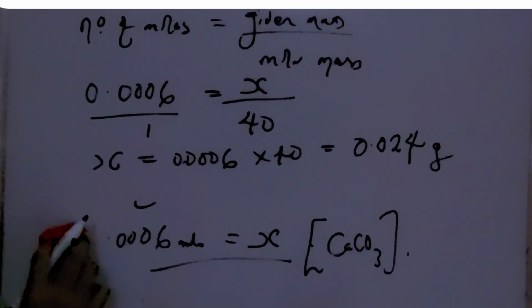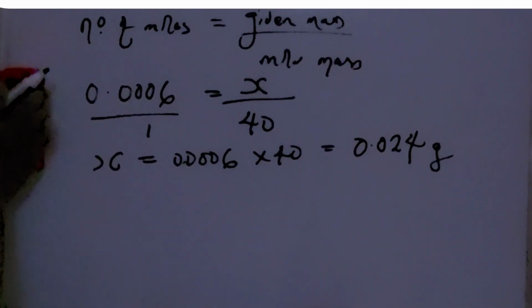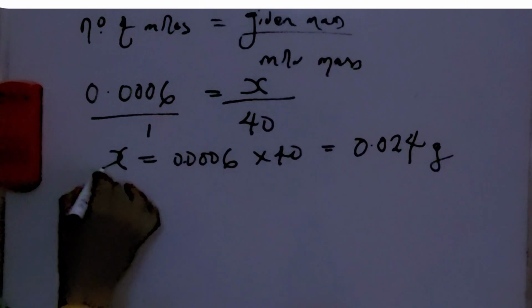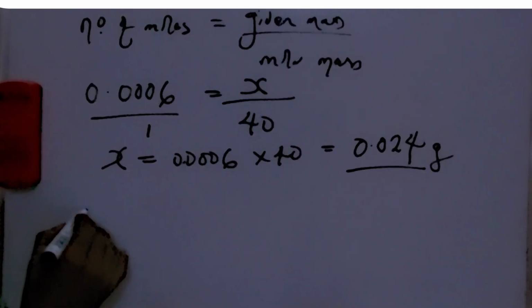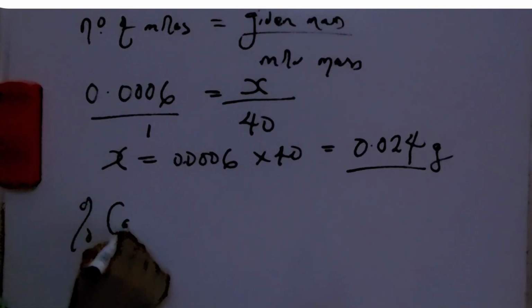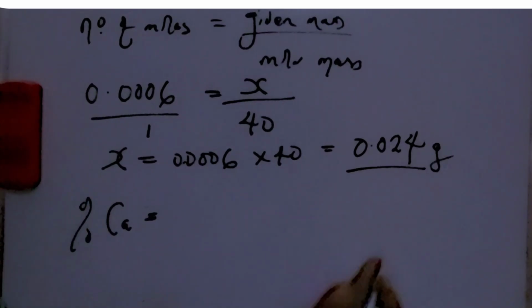You see how we used the number of moles of calcium carbonate to derive the mass of calcium. So we essentially get something like this. Remember, you should know what your value is giving you. This is an example. It's not telling you this is exactly what you're going to be getting. No way. So how would you calculate the percentage of calcium in the mixture? How much did you weigh in the first instance? That is what it's trying to ask you.